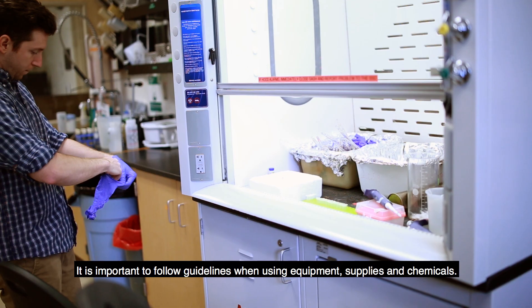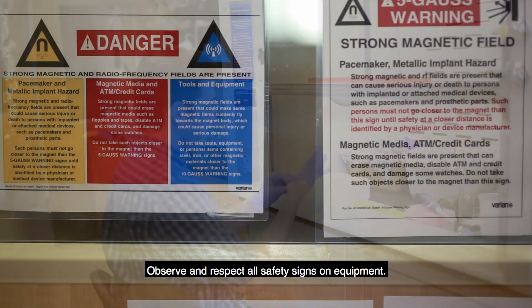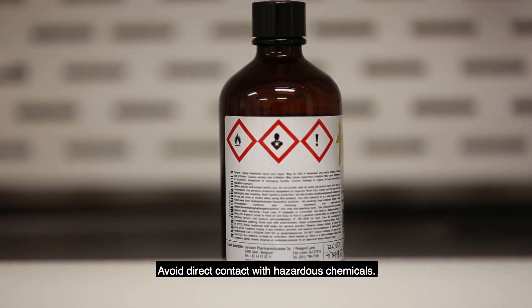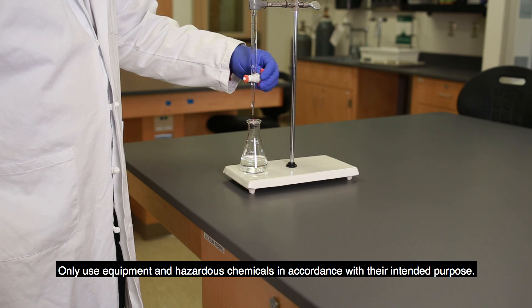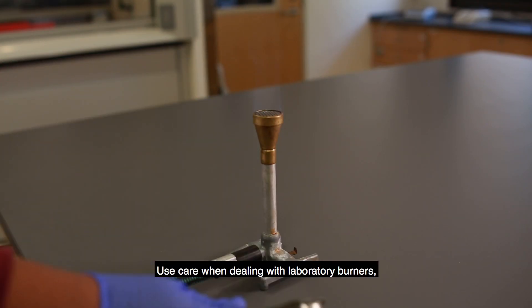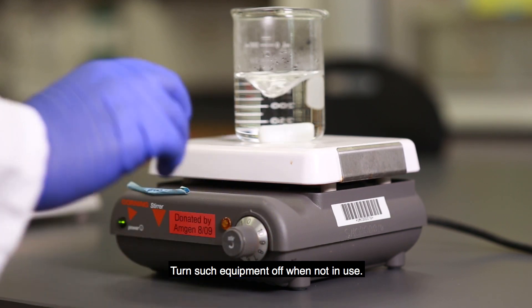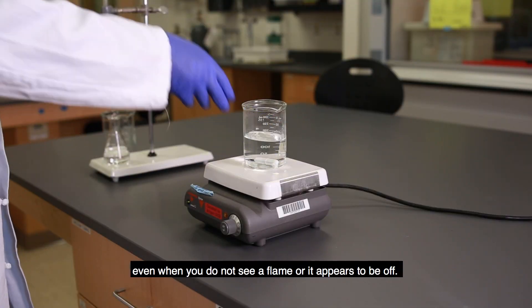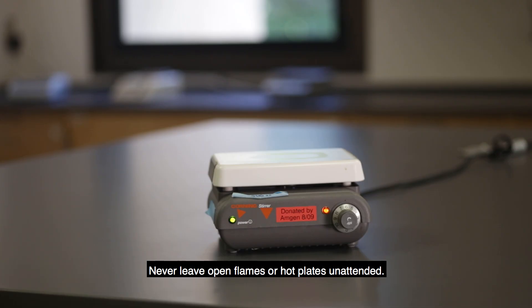It is important to follow guidelines when using equipment, supplies, and chemicals. Observe and respect all safety signs on equipment. Avoid direct contact with hazardous chemicals. Only use equipment and hazardous chemicals in accordance with their intended purpose. Use care when dealing with laboratory burners, hot plates, and steam generators. Turn such equipment off when not in use. Always handle such equipment as if it were hot, even when you do not see a flame or it appears to be off.